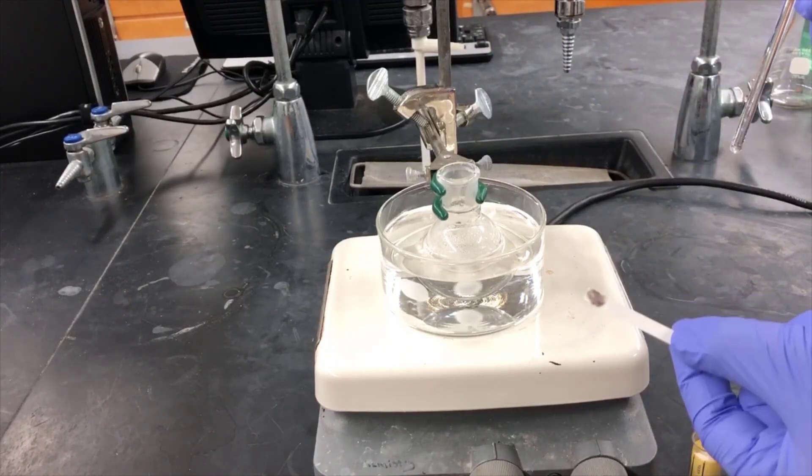The dark color we're observing here indicates that hypochlorous acid is still present, so we'll need to quench that, destroy that reagent before we move on to the distillation.